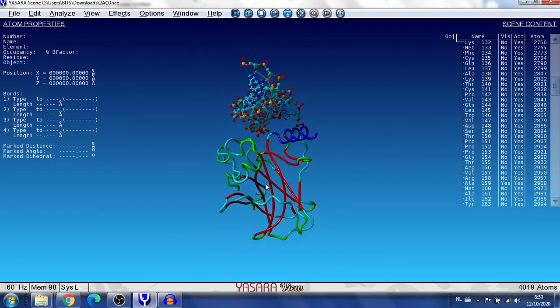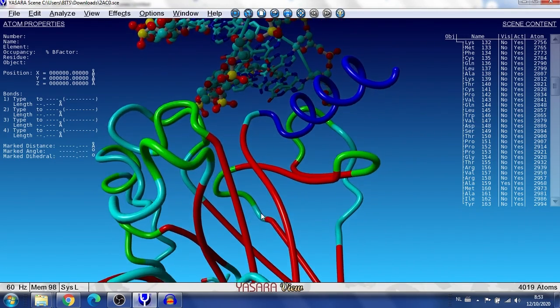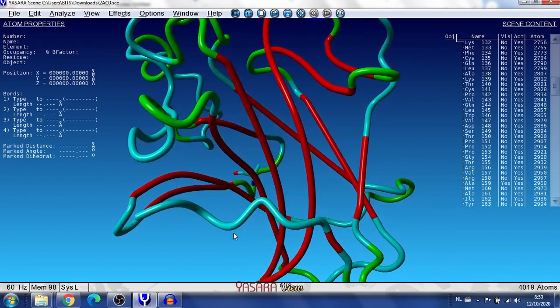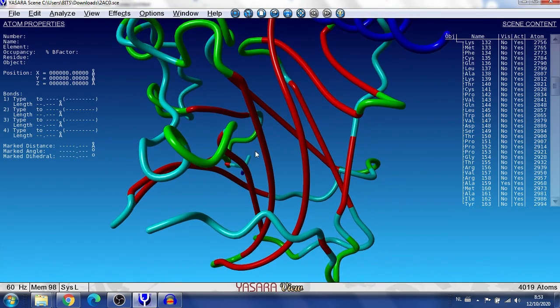It's very small. So here it is, in fact. So here's the side chain with one carbon atom and of course 3 hydrogens on it.